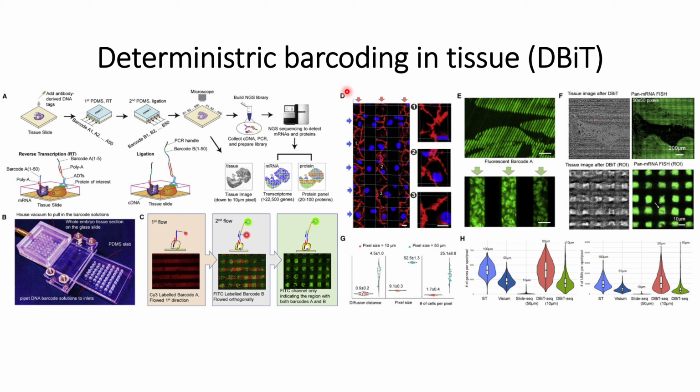The surrounding phenotypes will also play a role. So instead of using just single genes in an in vitro experiment, it is beneficial to identify the genes directly from the tissue. Before this, several other techniques have also been developed, but those techniques can identify only a few hundred genes, whereas this technique can identify thousands of genes at a better accuracy. So let us go through their sample preparation workflow.